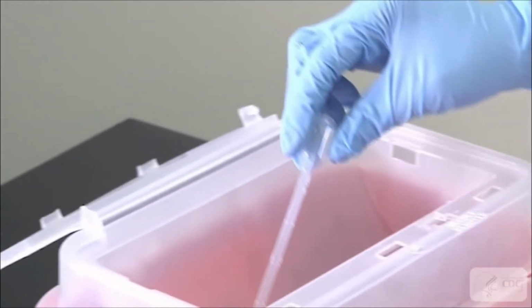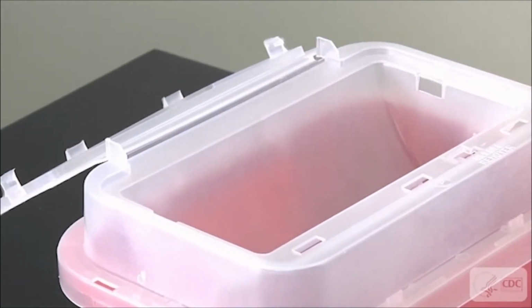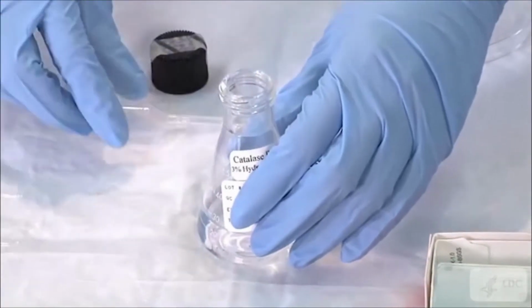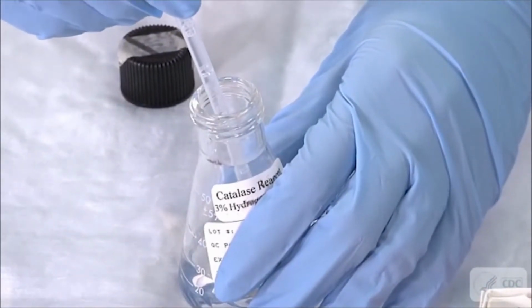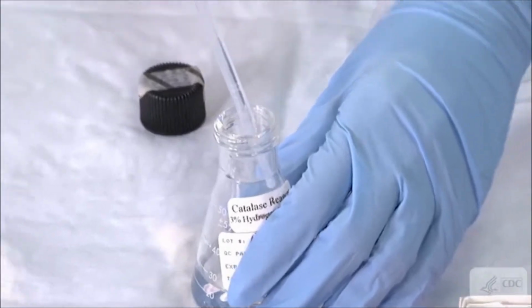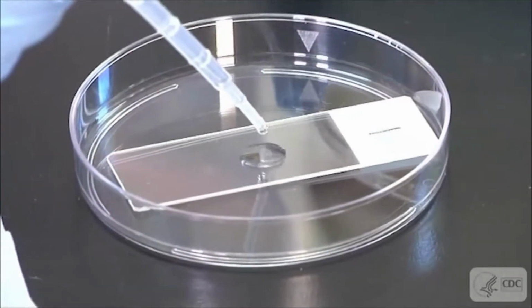Discard your pipette into a biohazardous waste container. To verify the accuracy of your reagents, next, test the negative control slide. Using a dropper, add 1 drop of hydrogen peroxide solution to the growth on the negative control slide and close the Petri dish. No formation of bubbles indicates a negative reaction.